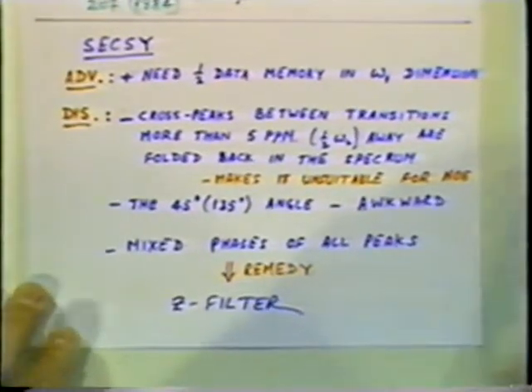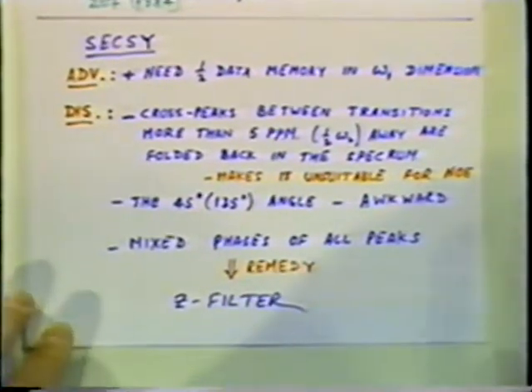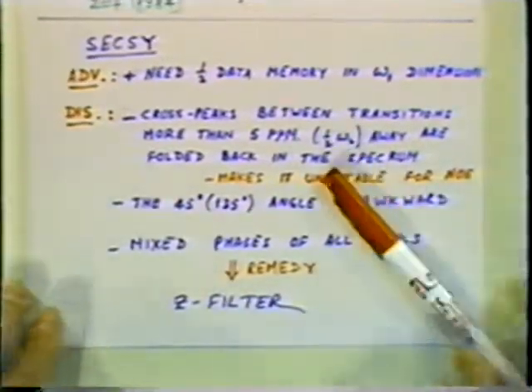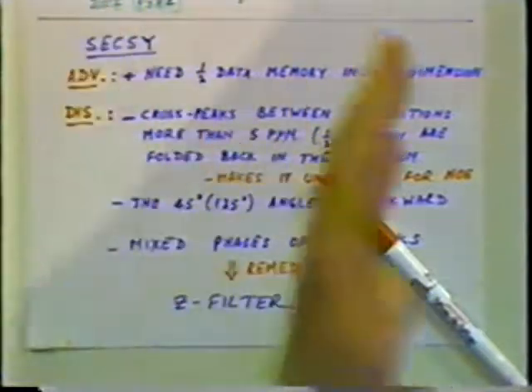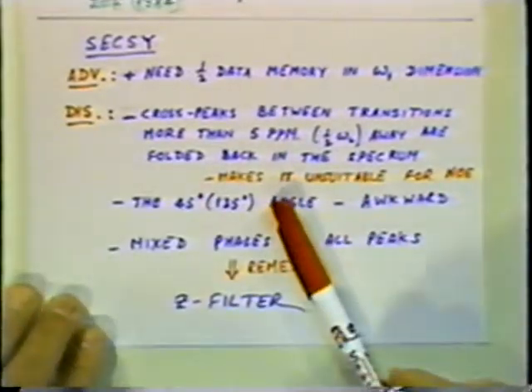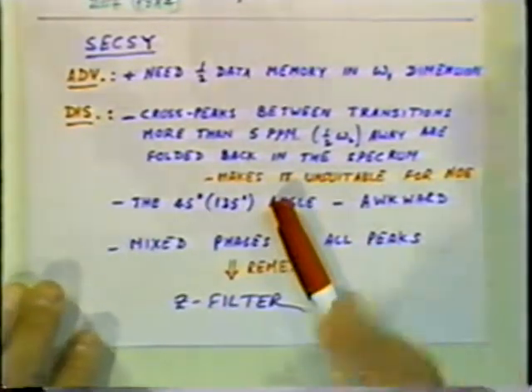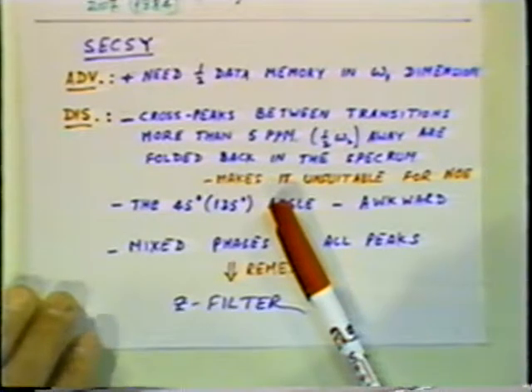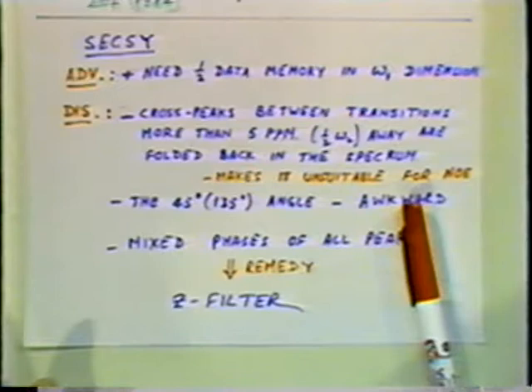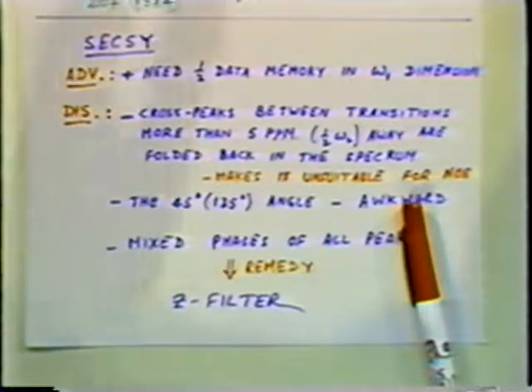Okay, but there are several disadvantages of spin-echo-correlated spectroscopy. For example, if there are cross peaks between transitions which are half the spectral width away, then they will fold back into the spectrum. And that is what makes this particular format of taking data unsuitable for the nuclear Overhauser effect, because there are certainly NOEs between transitions which are more than 5 ppm away, half the spectral width away.